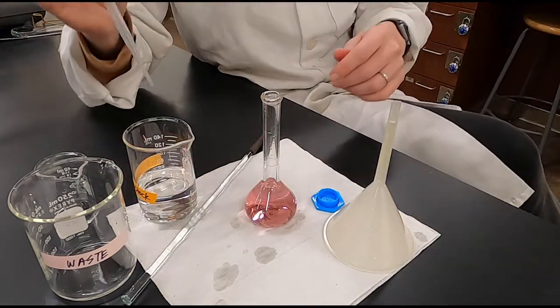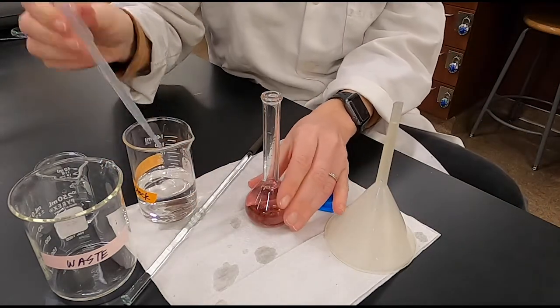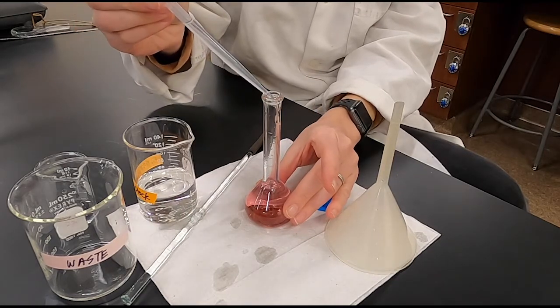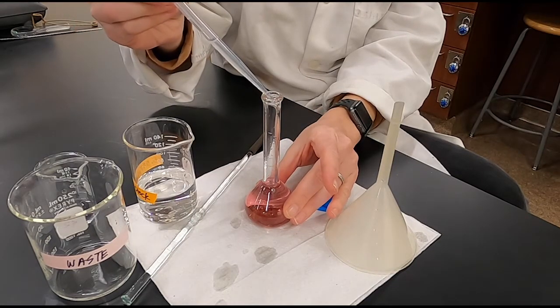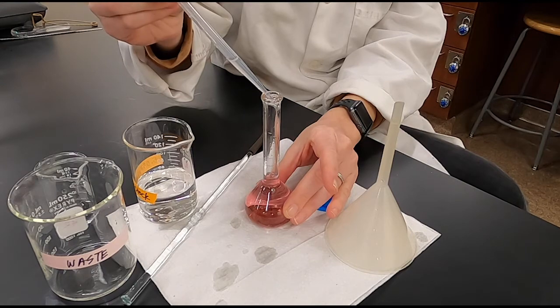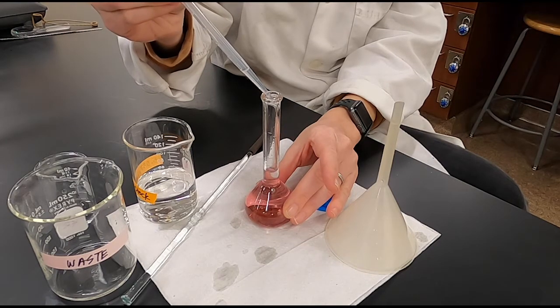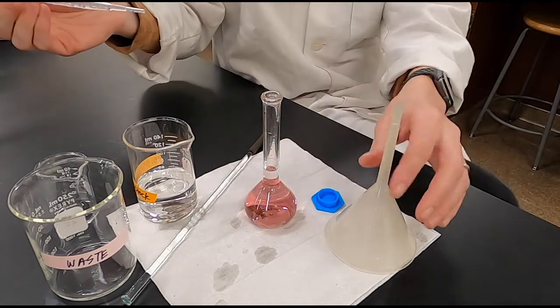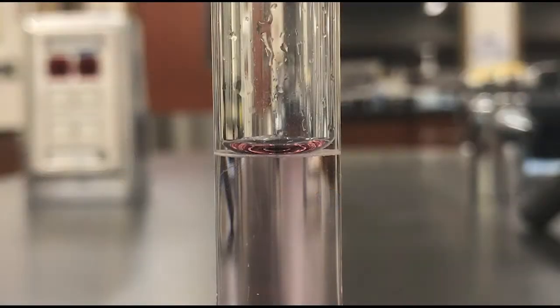Once you get close to the calibration mark, you do want to slow down and be careful by using a barrel pipette. When you get really close to the calibration mark, you want to add the solvent drop by drop while looking at the meniscus at eye level to make sure that it lies right on the calibration mark. Mix thoroughly for several minutes by inverting.